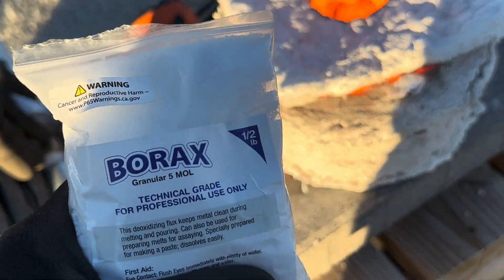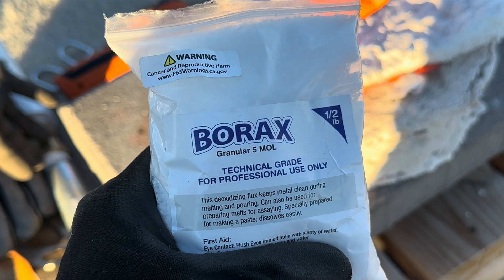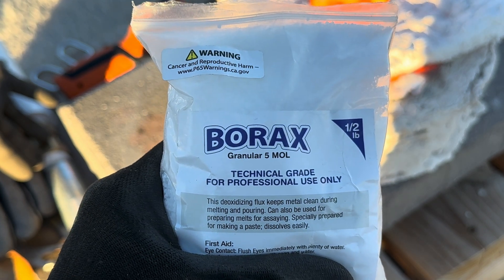We have reached the point in this procedure to add some borax into our cupeling process.